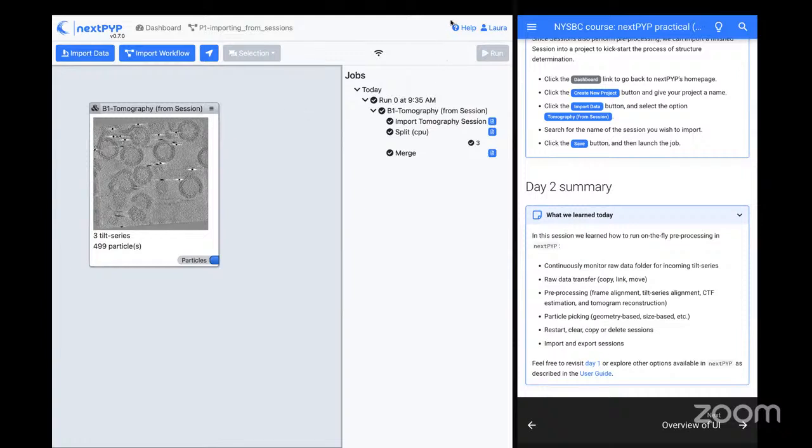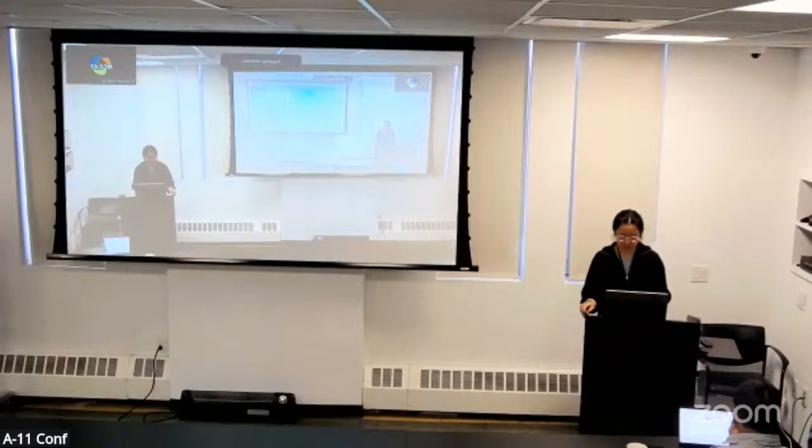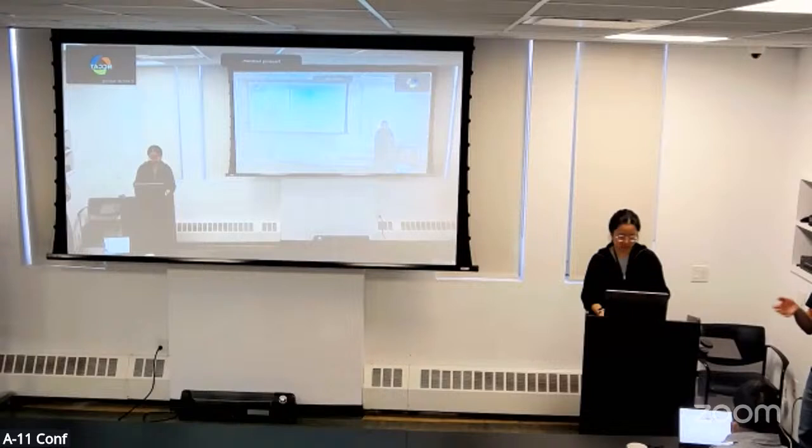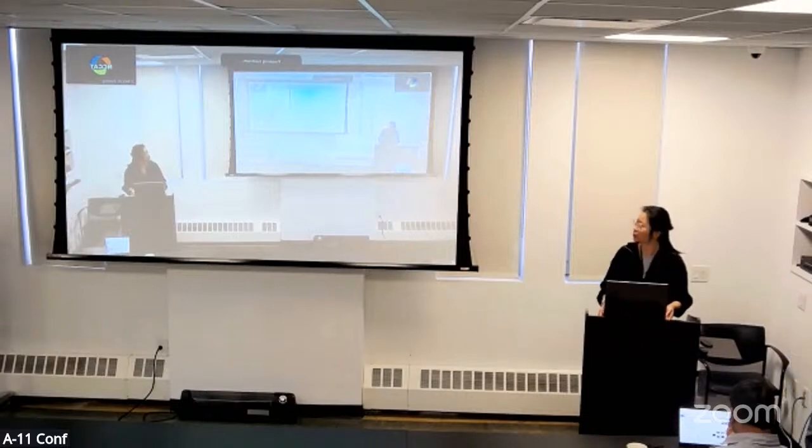I know some people were asking about being able to analyze their data within this week. We could arrange for that depending on how big the data is. We have to upload the data to our system using Globus, and then you'll be able to see it from these instances.